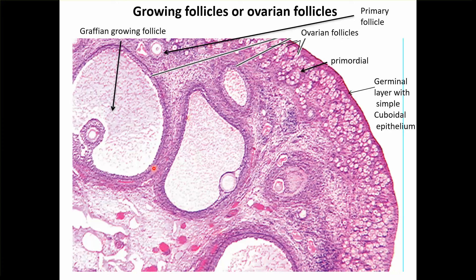The Graafian follicle — there will be only one Graafian follicle, in which the oocyte is pushed to the periphery. It has corona radiata around it and this attachment is called cumulus oophorus. It has a large antrum.